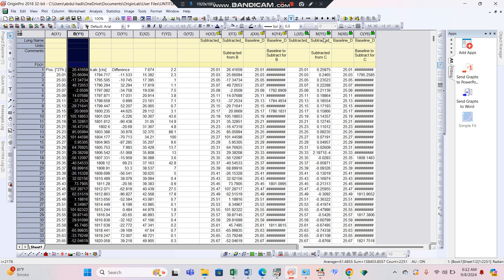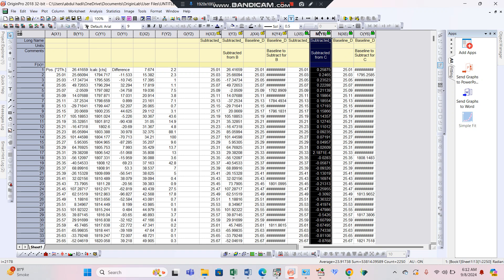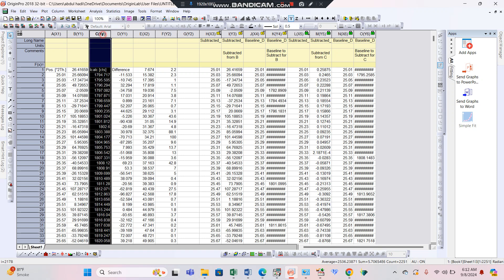Similarly, the subtracted data of I-calculated is present at column M-Y5. Copy this data and paste it into column C-Y1.